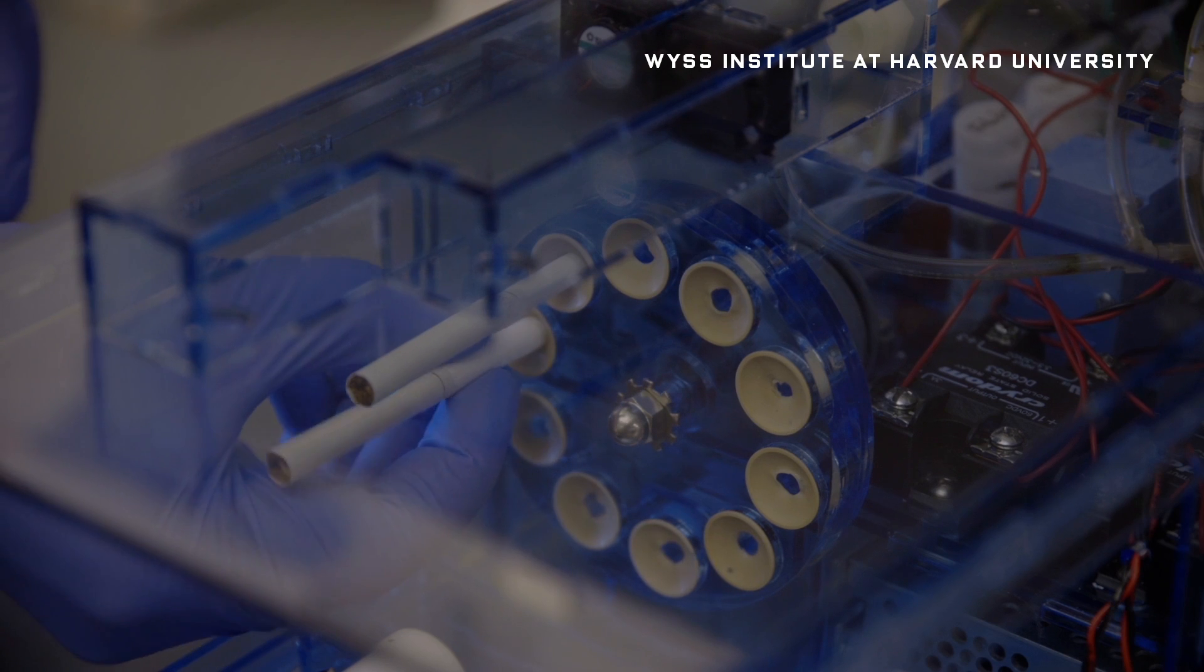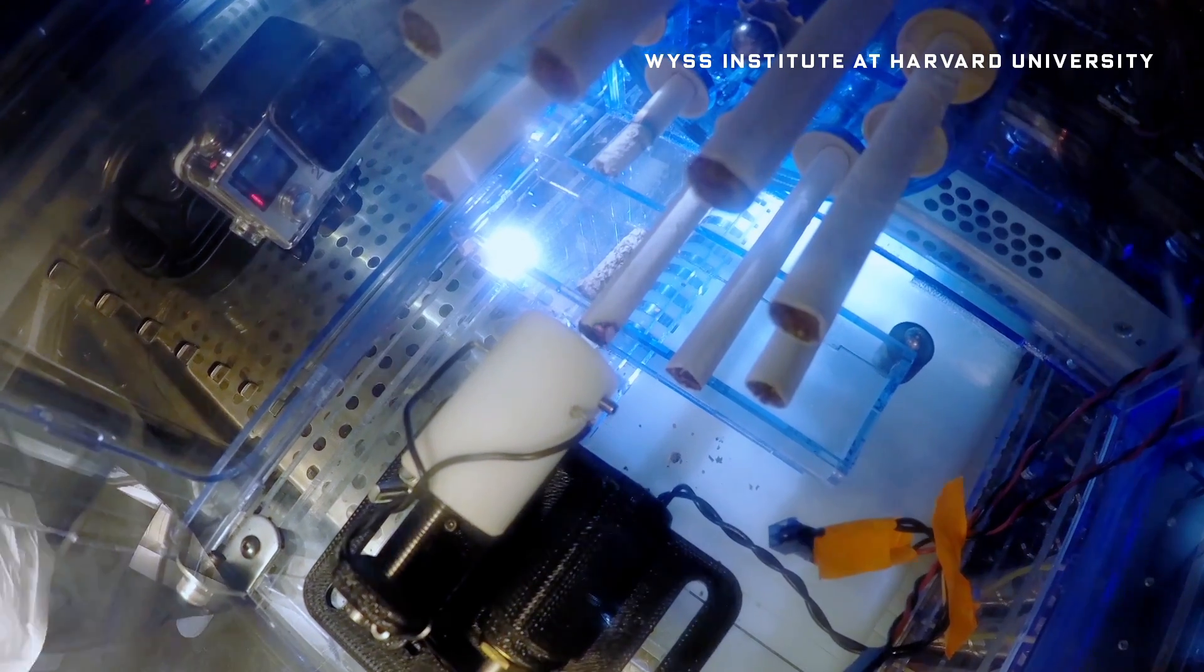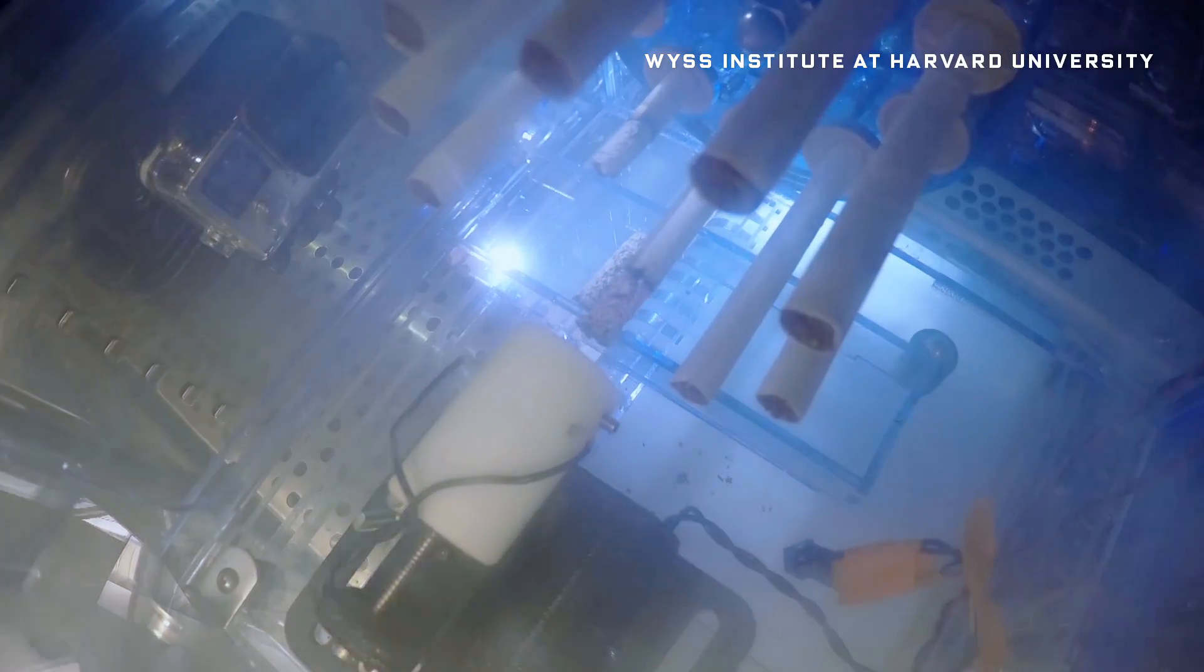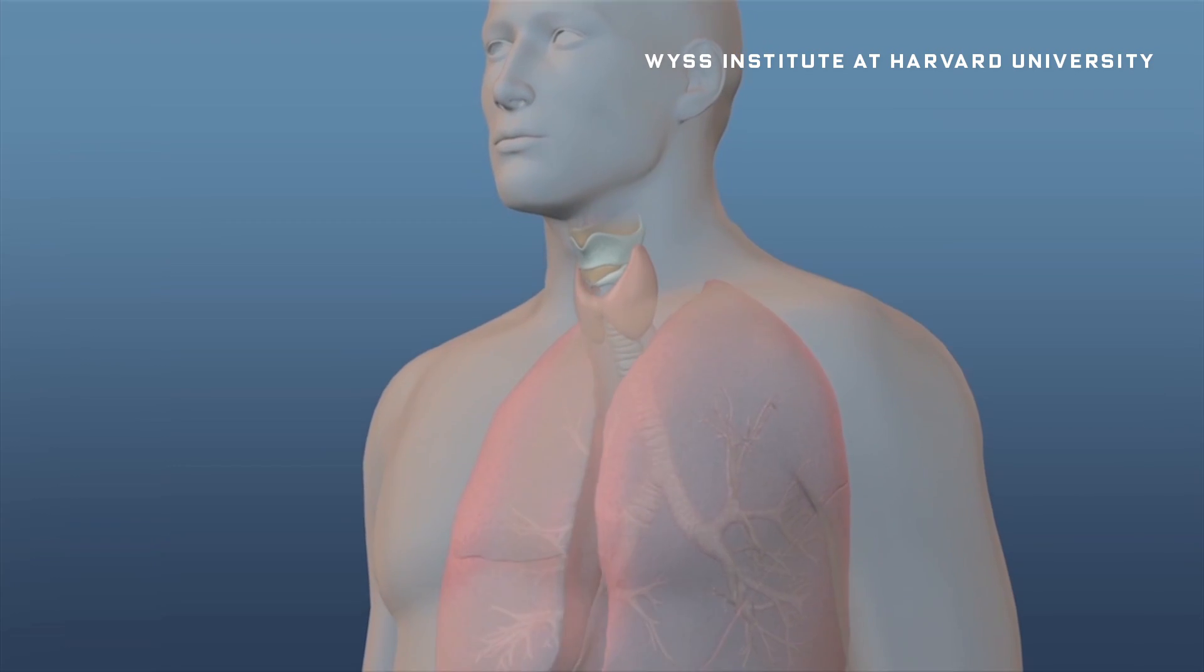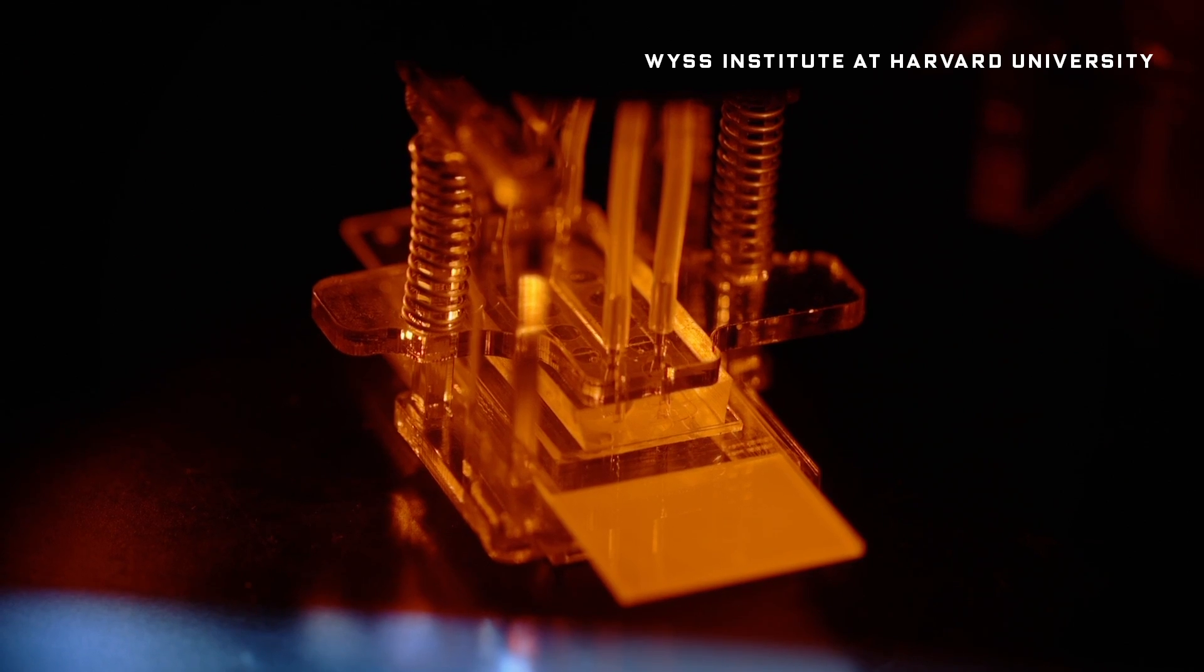The robot itself is pretty much a gatling gun of cigarettes. An automated lighter from a car fires up each smoke. The researchers can even program the robot to huff at different intervals and intensities.